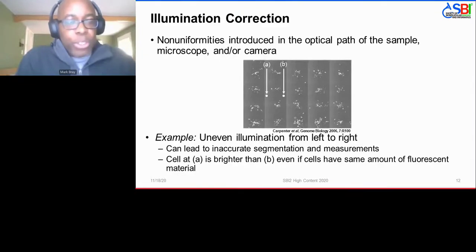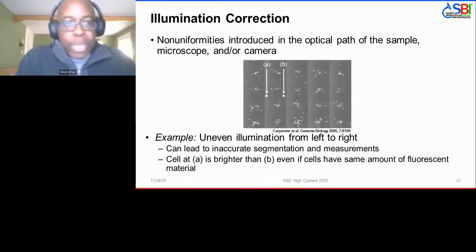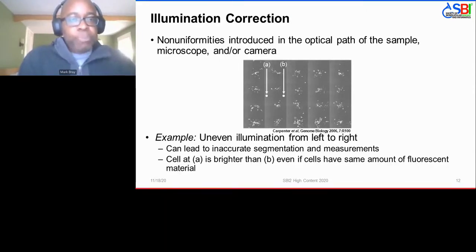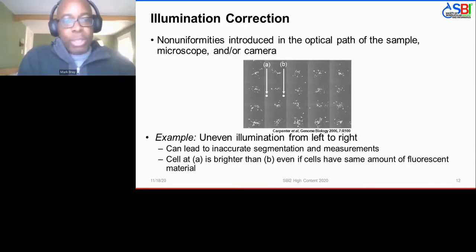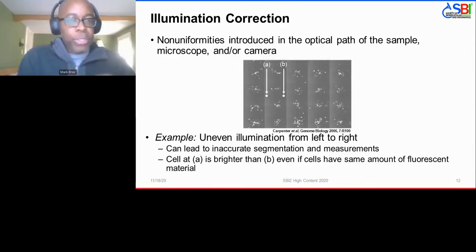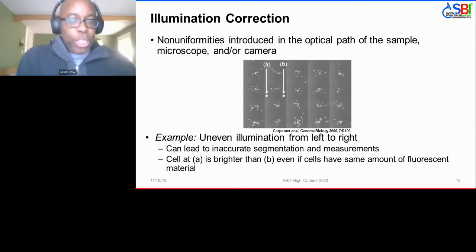In order to detect the foreground, there is usually some illumination correction that needs to be done. By virtue of using a microscope, the optics will introduce non-uniformities into your image regardless of the biological sample. For example, in a set of tiled images, the left side of each tile may be slightly brighter than the right side. If you're trying to identify the biological sample by thresholding, this gradient could bias your results. By correcting for illumination, you can even out this gradient so that a single threshold might actually work.